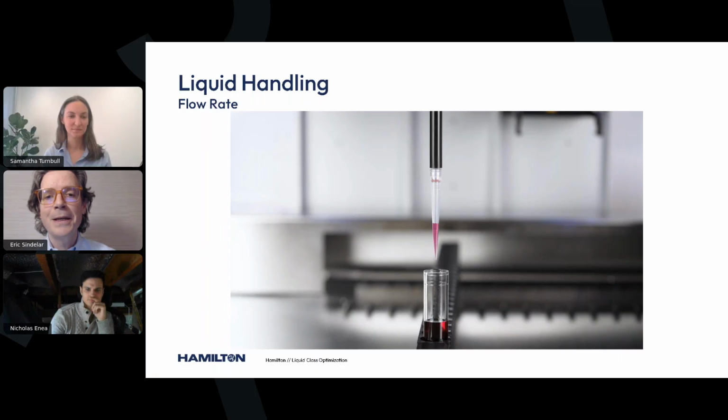Now on the dispense, the flow rate is very slow, so in this case the dispense isn't a steady stream of liquid but is actually just droplet by droplet. The liquid is being dispensed and emptied out of the well. Slowly but surely, the liquid will work its way out of the pipette. What this mode is typically also characterized by, here we're dispensing above the liquid level or into an empty well, is a volume of air called a blowout volume, also known as a trailing air gap, that helps push the liquid out of the tip and into the receiving container.